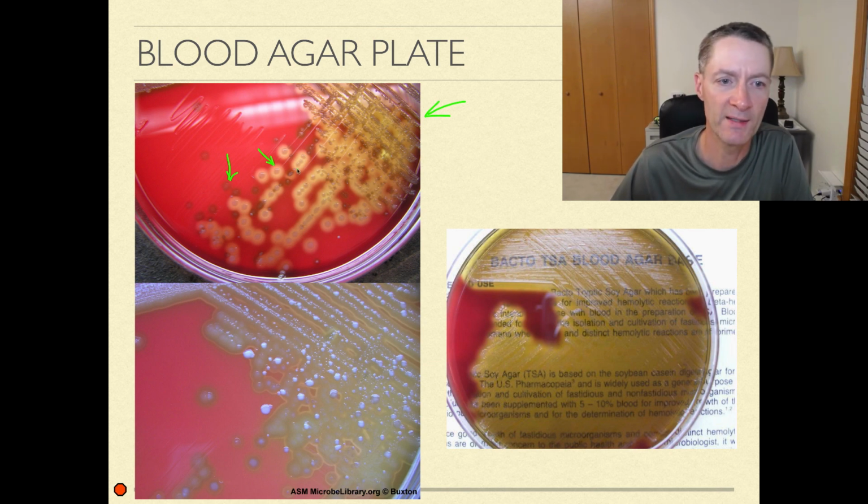So what I see here is definitely not a pure culture. It looks to me like a mixed culture, with a mixture of alpha and beta hemolysis going on.